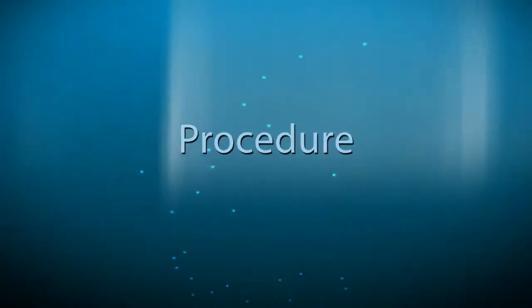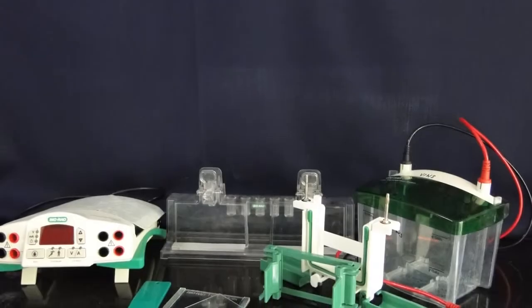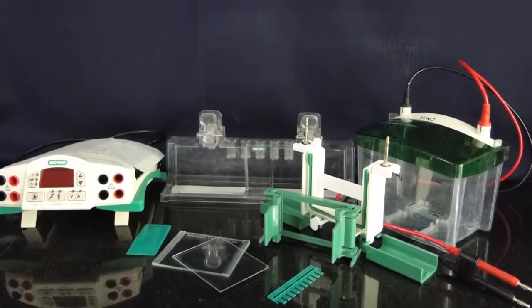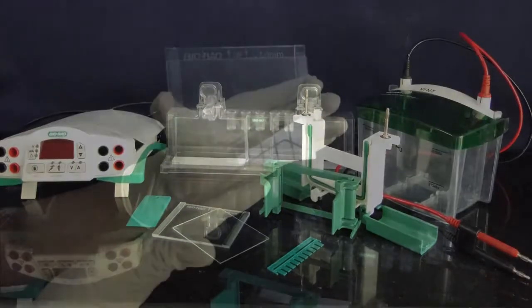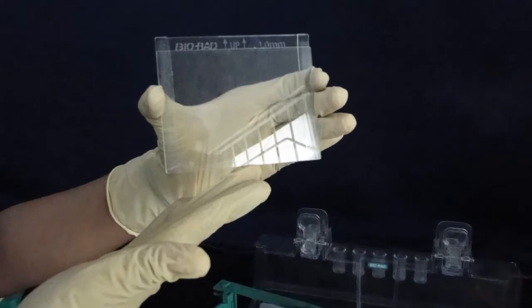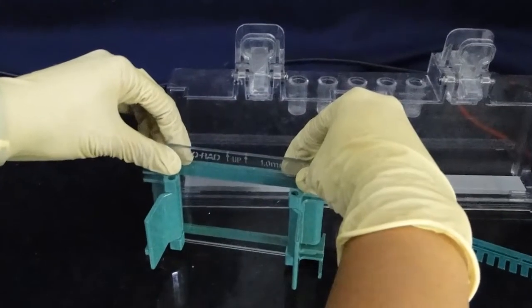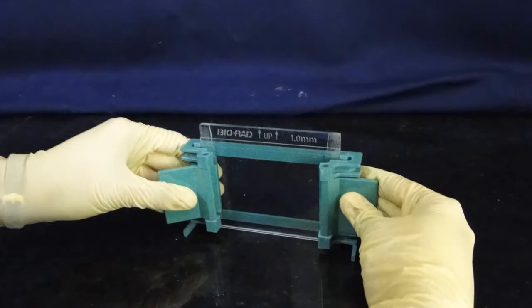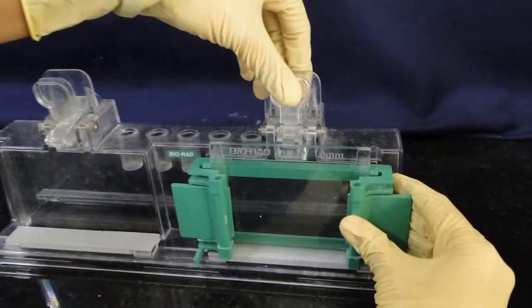Procedure. The experiment begins by assembling the glass plates. Assemble the glass plates on a clean surface. Lay the longer glass plate down first and then place the shorter glass plate on top of it. Embed them into the casting frame now and clamp them properly. Make sure that the bottom ends of the glass plates are properly aligned. Then place the frame on the casting stand.